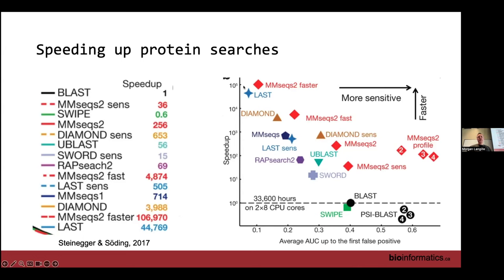The reason we've decided to brew our own versus HUMAnN, even though we use HUMAnN quite a bit in the lab, is that, like Monica recently ran some metagenomic data and I said, no, just run it through HUMAnN, it's going to be great. It's good. But I'm personally really interested in this stratification sort of thing, and we've developed some tools around this. Although this looks really nice, the reality is when you dig into the data, mostly from HUMAnN, you're going to get a very significant proportion being from the unclassified. So you don't get a lot being stratified really well. That mostly came down to the restrictions on MetaPhlAn and that first step.